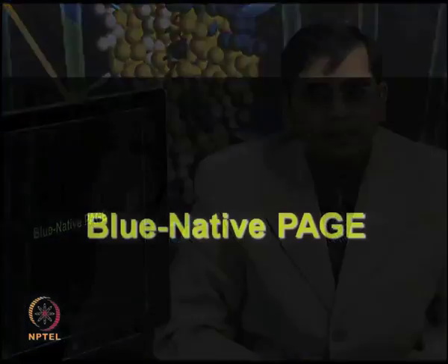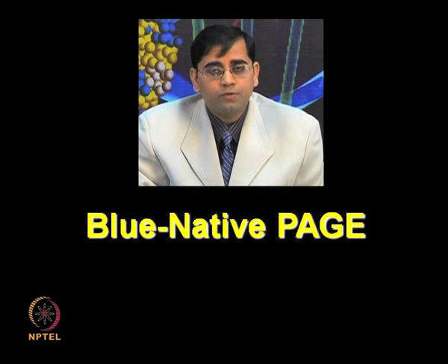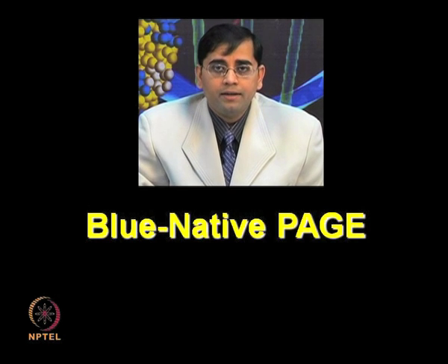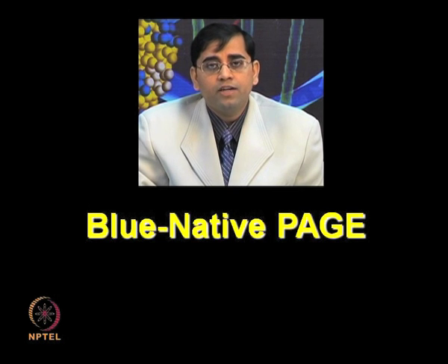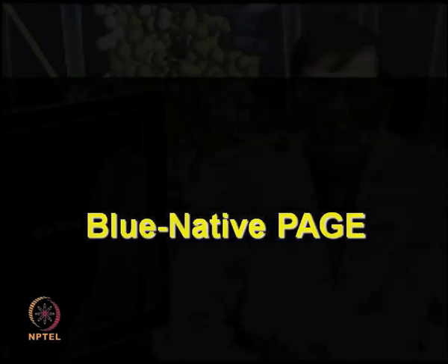So, let us now move to a variation of SDS-PAGE known as blue native PAGE, blue native polyacrylamide gel electrophoresis. In SDS-PAGE, we are providing a denaturing environment. We want to denature the protein, whereas in blue native PAGE, we want to separate the proteins in their native condition.